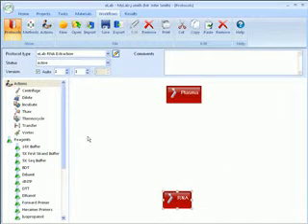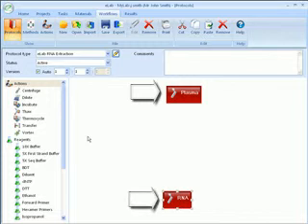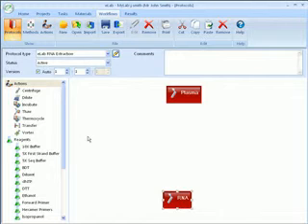The RNA extraction protocol type specifies the input and output sample types, in this case, plasma and RNA. In our protocol, we take 150 microliters of plasma and produce 50 microliters of RNA.